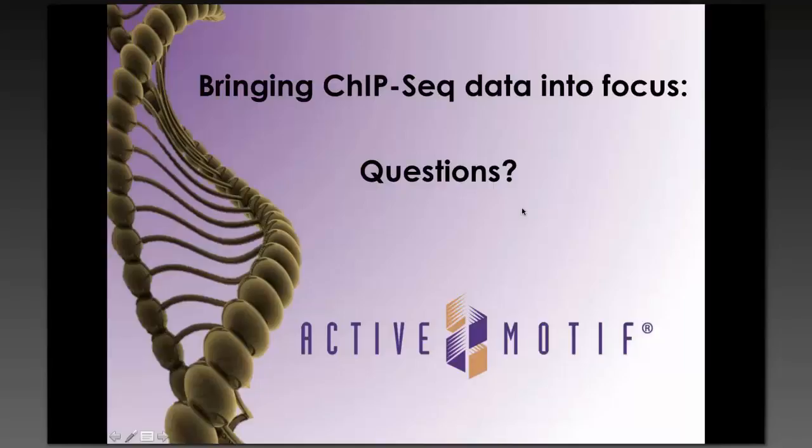If you think the over-amplification is due to library preparation, why not just add Drosophila DNA immediately before your library prep? You know, we didn't go that route. We wanted our spike-in to mimic the complexity of the entire reaction, and we wanted to be able to follow it through the various steps. That was our starting point because that's what made the most sense for us. So we did not pursue spike-ins at other stages. This seemed to work so well that we didn't readdress whether it could be done a different way.